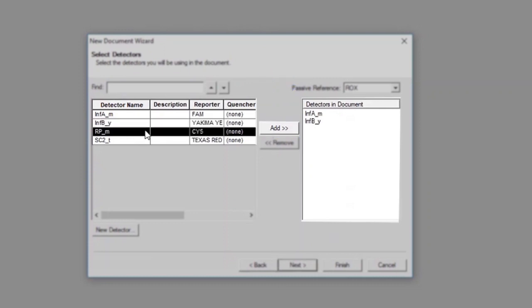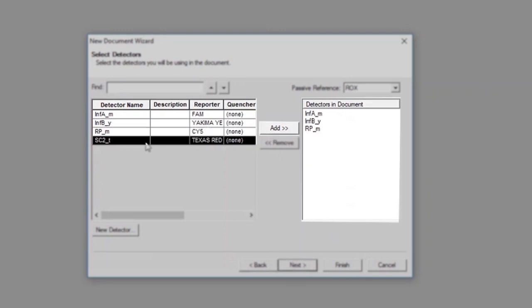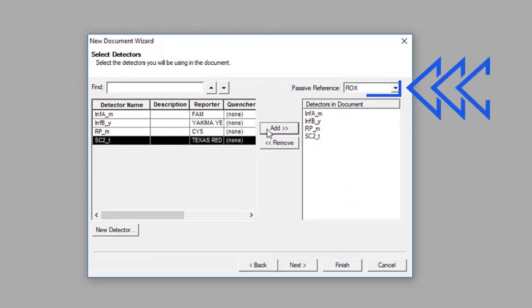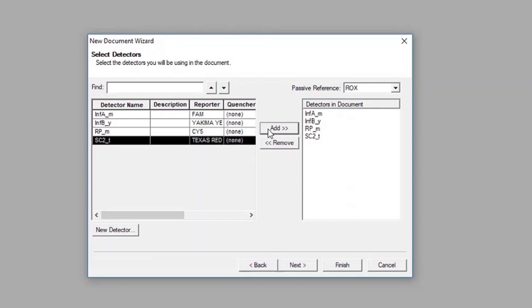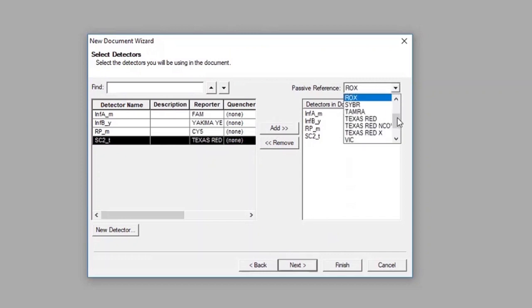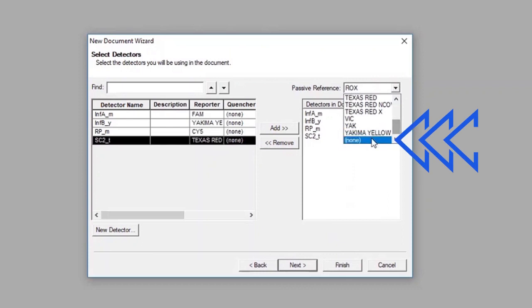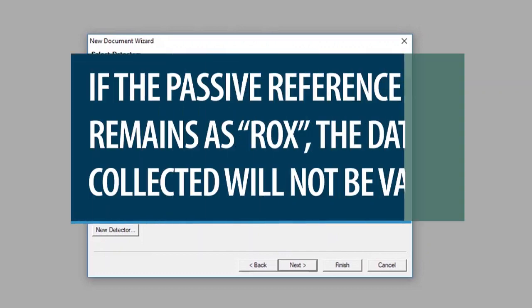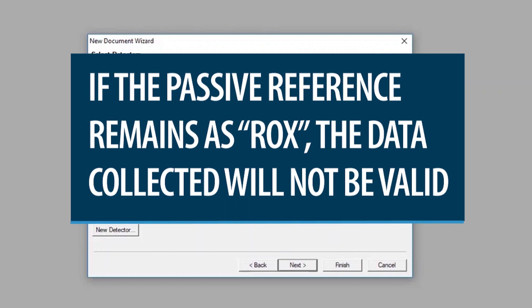Selected detectors will appear on the right side of the Select Detectors window. It is important to set the passive reference to None, as the default setting is typically ROX. Do this by selecting None from the drop-down menu. It is critical to make this update because the fluorescent signal for the SARS-CoV-2 target is measured within the ROX wavelength. Thus, if the passive reference remains as ROX, the data collected will not be valid.